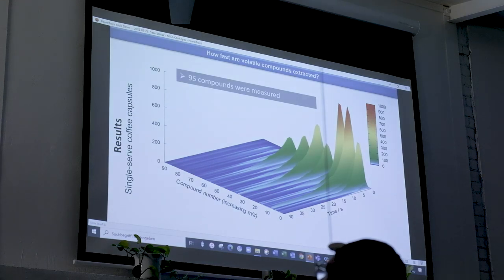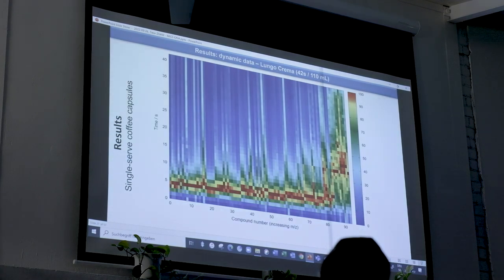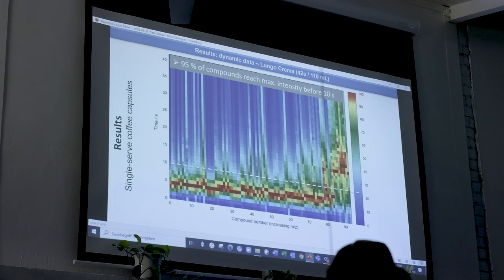That's where the extract is very rich. And then the rest of the extraction is, in a way, there's still things coming, but the content of the aroma is very low. Here is the same picture looking from the top, and the red points are always the maximum of the intensity for these 95 compounds. You see that most of these compounds reach a maximum in their intensity or concentration in the extract before 10 seconds. So really, most of the aroma in your extraction is coming in the first 5 to 10 seconds, and after that, you still have, of course, a little bit of aroma coming, but it's very little. And that's the second element of the extract chill. So you see some compounds are coming later, but it's just a small group.